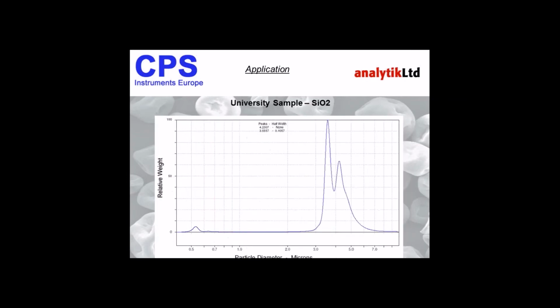Okay, coming towards the end of my presentation, I'm going to finish with one last example, a very funny example. I do visit a lot of universities and I do run a lot of student samples. On one occasion, a student came to me and said, I've been working with silica particles for quite some time throughout my PhD. And I'm coming to the end, I'm writing up, and it'd be great if I can include your data in my thesis. I've been using laser diffraction and DLS. I've always seen one peak at 4 micron.